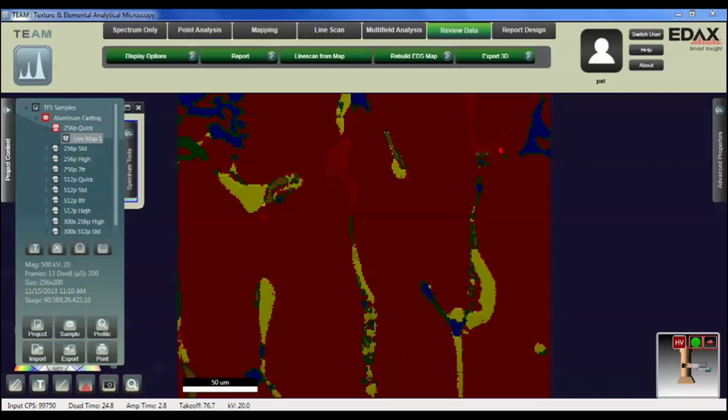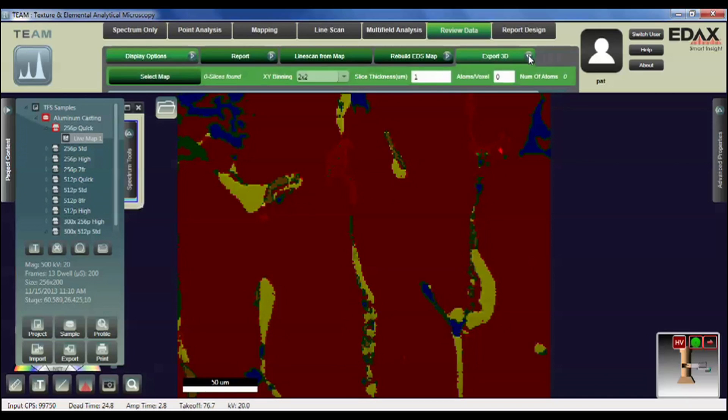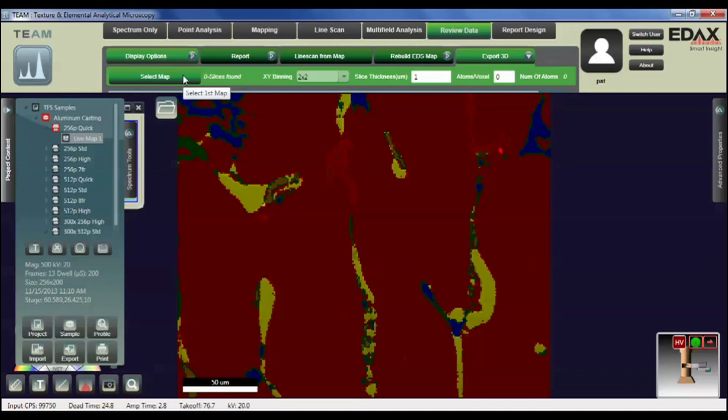You can load any map file as I've shown here. The advantage of that is that it activates the Export 3D option on the Review Data menu. So I can go up there and lock it in so that we can edit the various values as needed for the analysis to export the total slices.